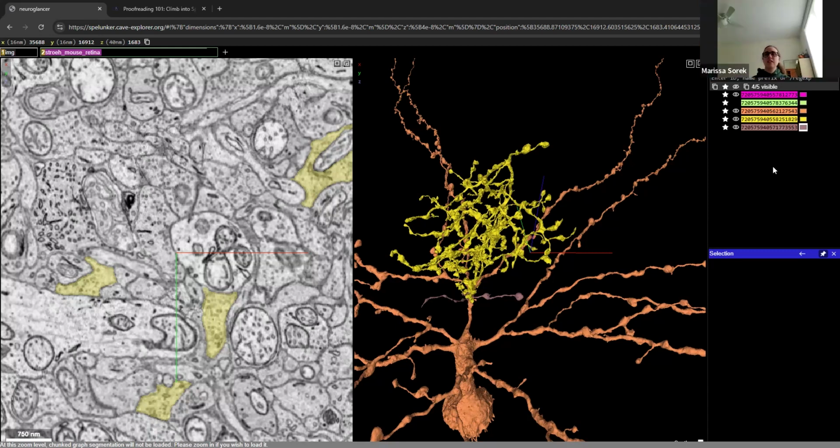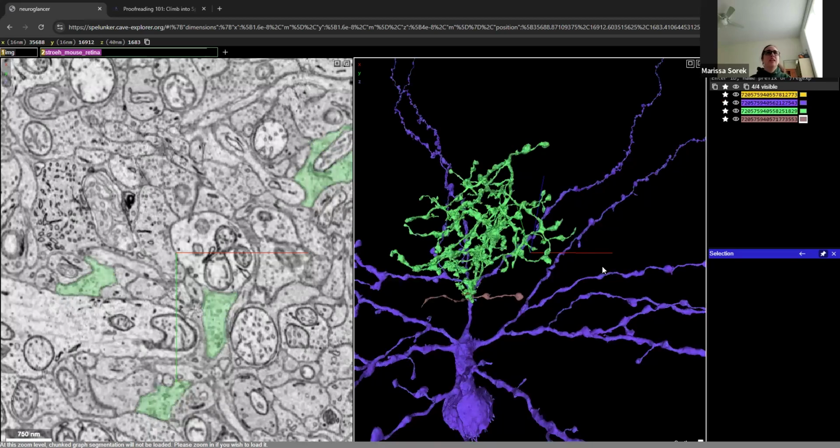And that's something to note because sometimes it's confusing: why do I have two segmentation lists here? They look the same, and it's just because one is the search list and one is the active working list, I'd say. So let's get out of these muddy colors we have here. Okay. So that's our segment ID list.